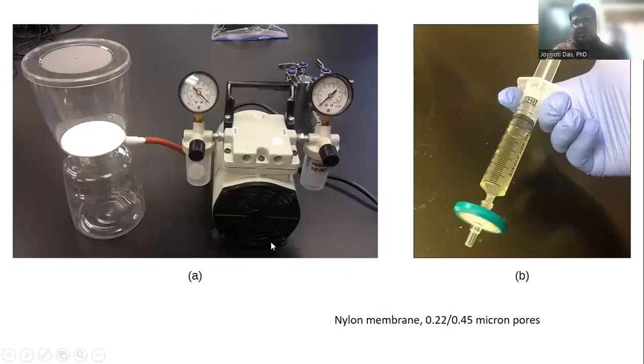So this is the realistic view of the setup that you use for membrane filtration. And to create a negative suction, what you attach to the nozzle of the bottle in which you are collecting the media is a vacuum pump. So this creates a negative pressure, and the media then descends through the filter and gets filtered.